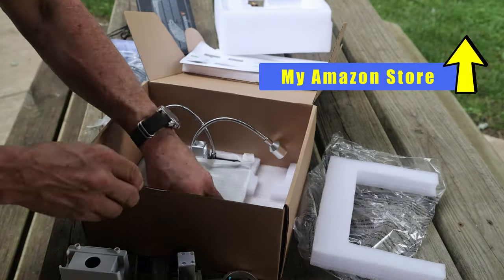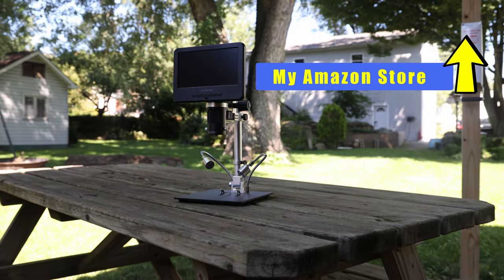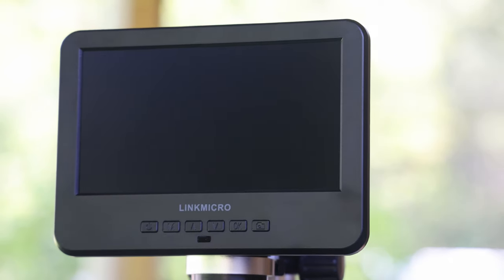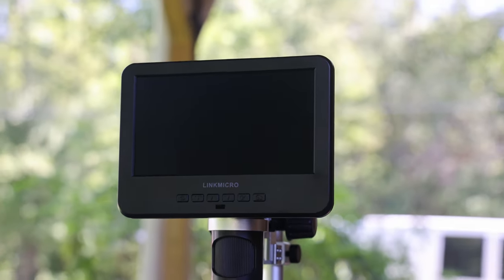Clicking on the link really helps this channel out, even if you don't buy a microscope. Full disclosure, LinkMicro sent me this microscope for free in exchange for making this review video.